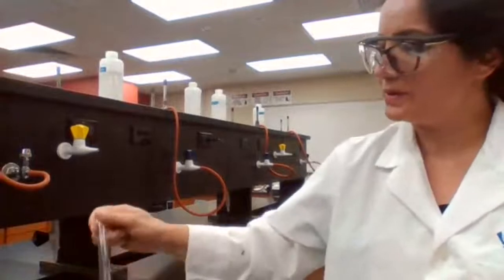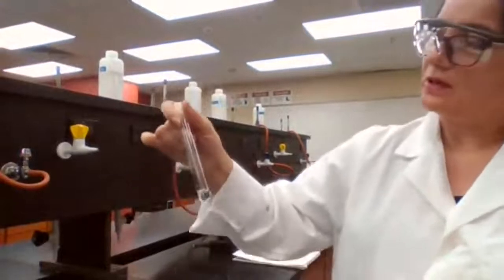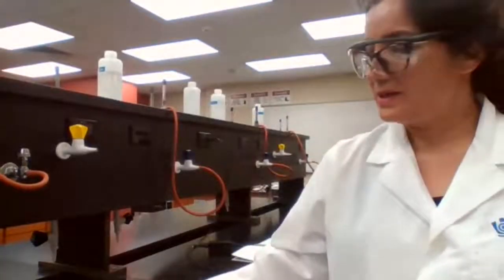I was just nervous because it didn't happen right away. But after I left it for a while and I went a couple times looking for solid ammonium chloride to make the solution again, good news was that it did form the crystals and it worked actually.